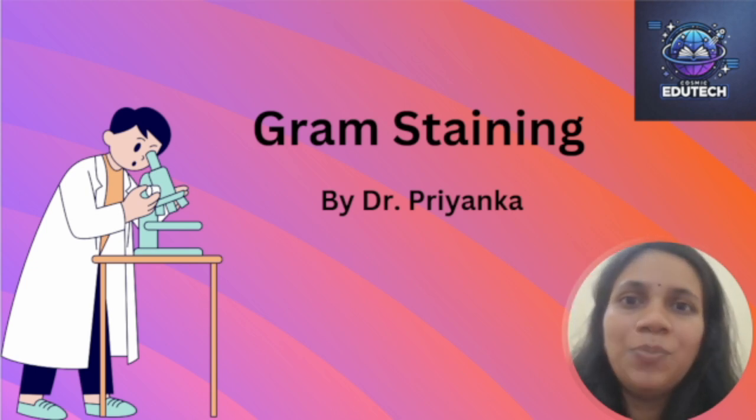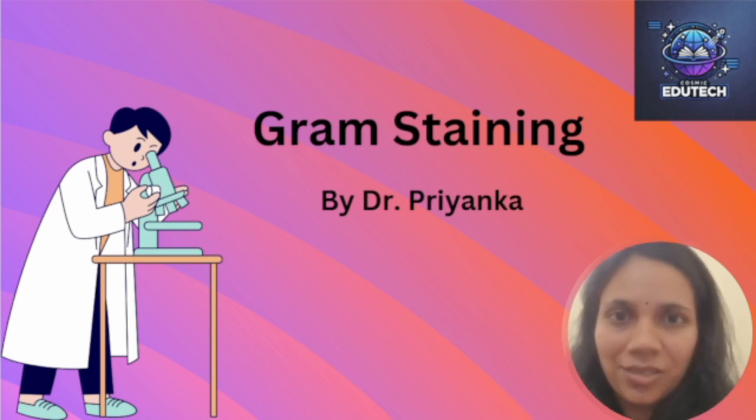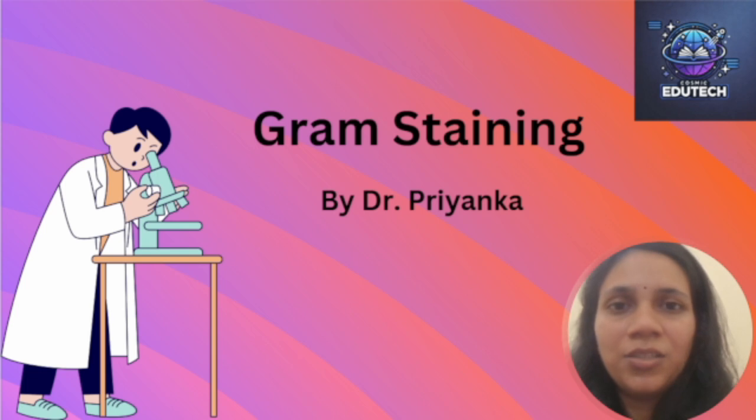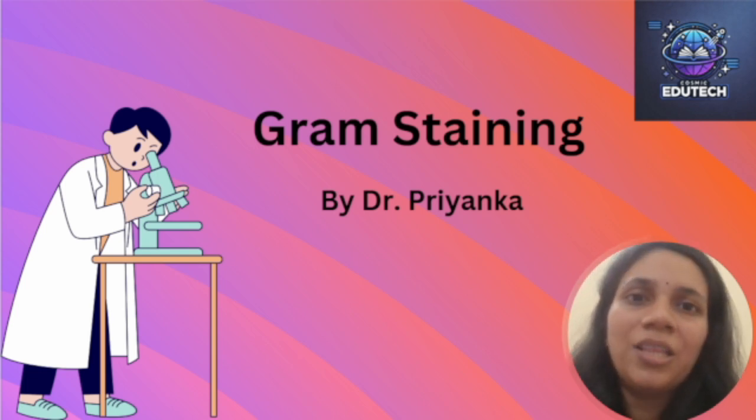I'm here with a very simple concept, that is gram staining. For those students who have just entered the first year of life sciences, maybe biotechnology, microbiology, or any stream of life science, this is going to be your very first staining technique that you are going to learn. I always found students who get confused between gram positive and gram negative and end up reporting the wrong things. So for such students, this will be a very simple way to understand the link between the theory and the practical aspects of gram staining.